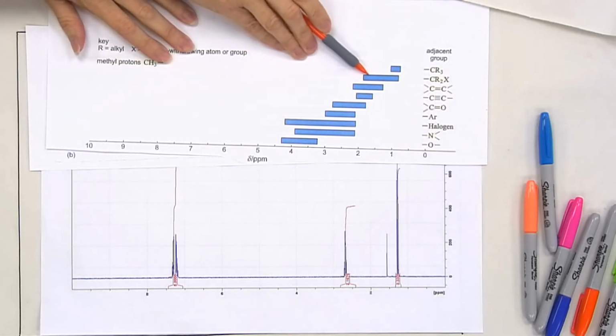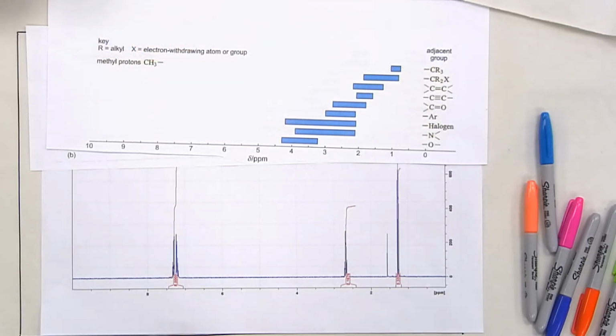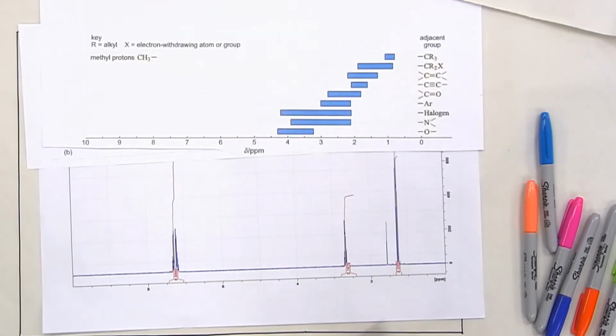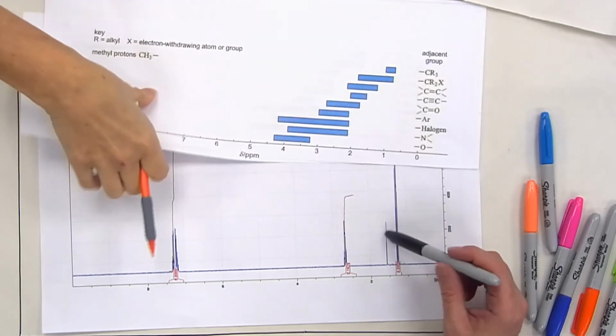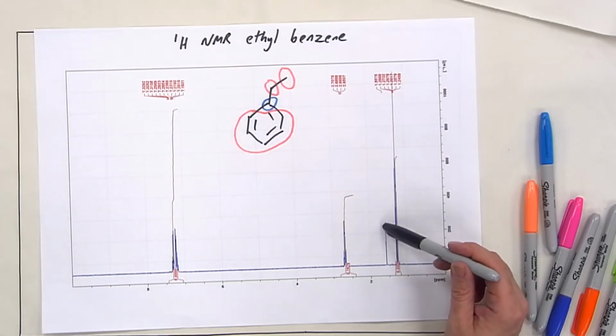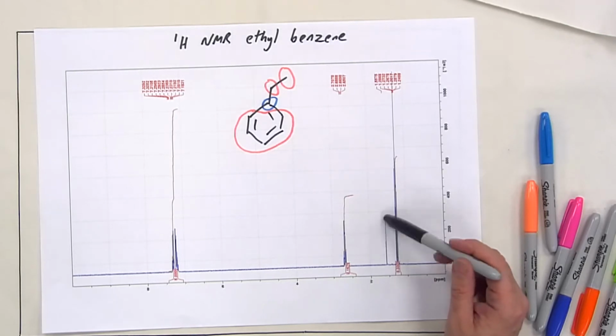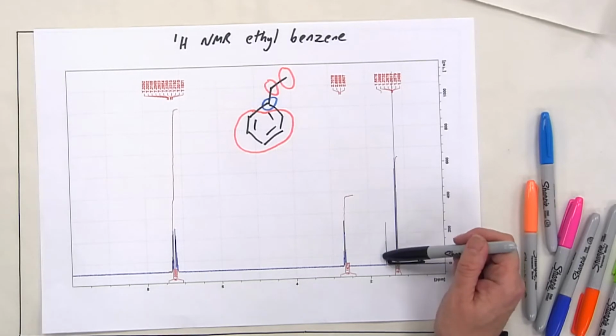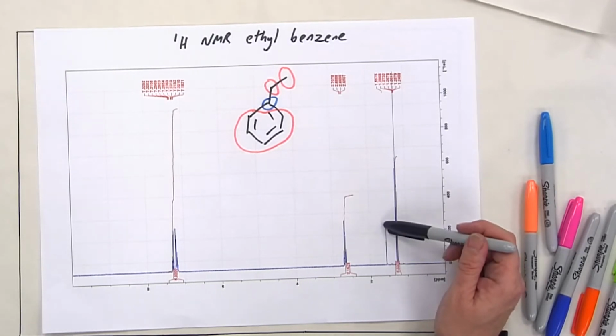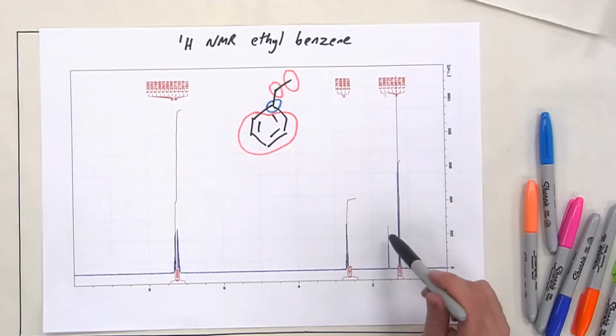So where's that? Roughly around 1 to 2? Yep, 1 to 2, and ours is about 1.3 ppm, so that fits all quite nicely. So is it worth pointing out that this is an impurity? Yes, this is probably an impurity due to the solvent. You might be able to see, we haven't integrated this line, and the reason we haven't integrated this line is we know this comes from an impurity, so there's nothing to worry about there.